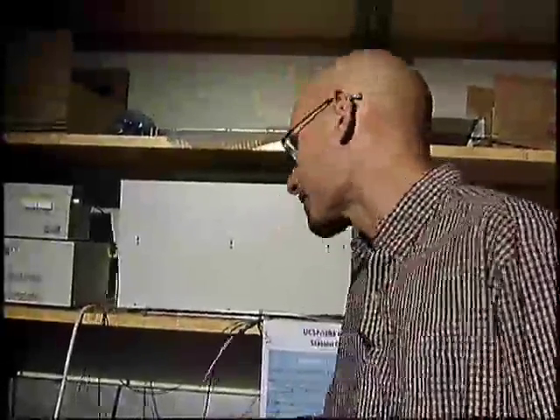Similarly, we have a second optical fiber right here that takes the light from the scan head that comes out of the sample and then sends it into this box up here, which has the detectors that detect the emitted light from the sample. So what you can see here is we now have the confocal scanning, and these shutters back here you can see are opening one at a time to let each of the wavelengths into the microscope.